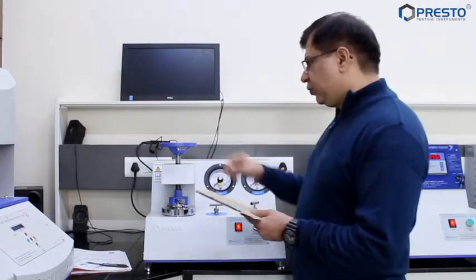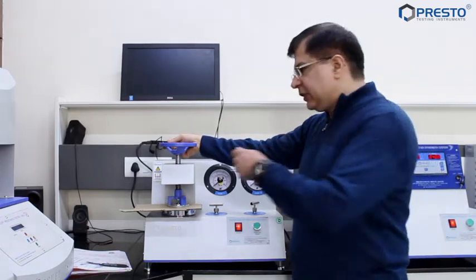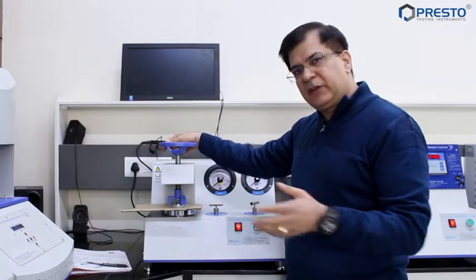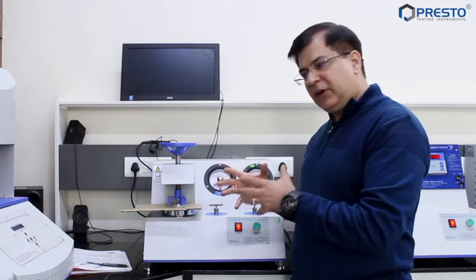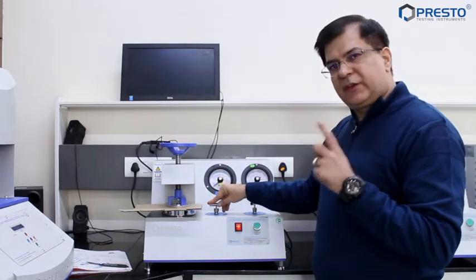This is the clamp. I'm going to use a corrugated box sample here, which I have cut for easy usage. We will open the clamp and now we're closing it. You have to take care that you should not tighten it very hard or very loose. Many times I have seen customers tightening it so hard that the bursting strength changes — they squeeze the flutes until the sample is really tight. There is no need to tighten it very much.